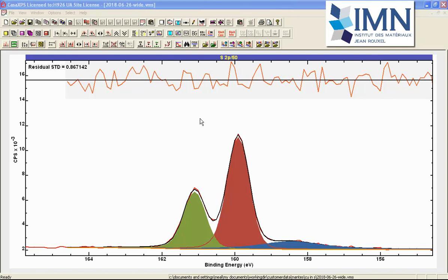The output that we would expect from such an optimization is the position of these peaks. The position is important because we wish to assess the binding energy for these photoemission lines, and these can give us the chemical state — so if we had sulfate versus sulfide, we would expect a different binding energy. The other output would be the area, which represents the amount of substance, so we can compare Gallium here against the sulfur here.